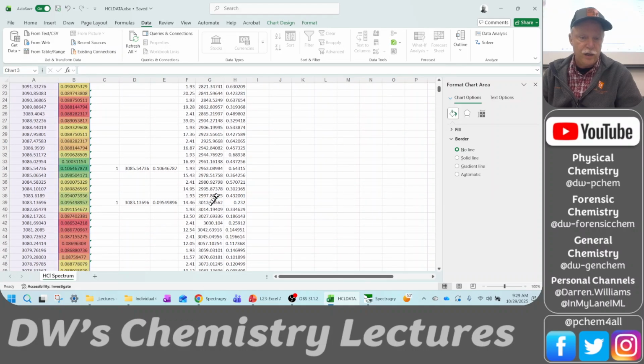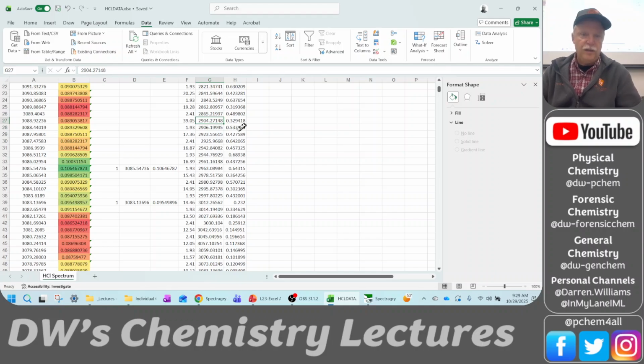So we go down here to 2904. Okay. And it should have the R line, the 35 isotope should have the tallest absorbance. So we have 2904 and 2906. Okay, so those two are together, and so that's going to be R0.